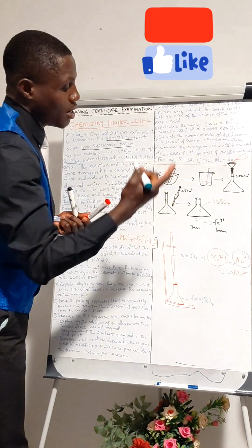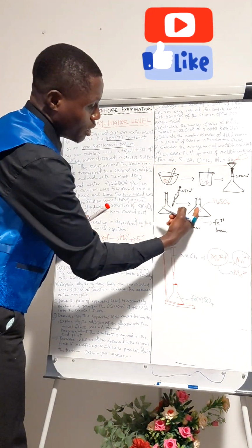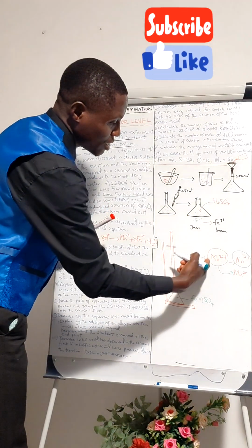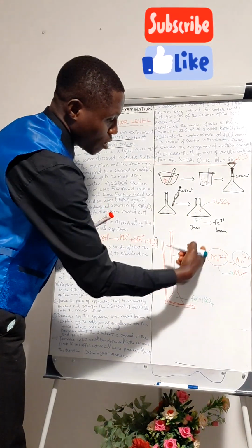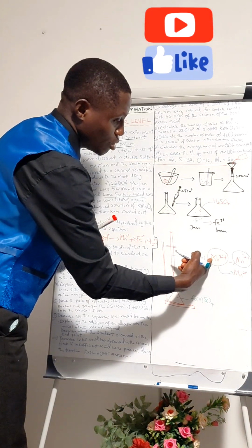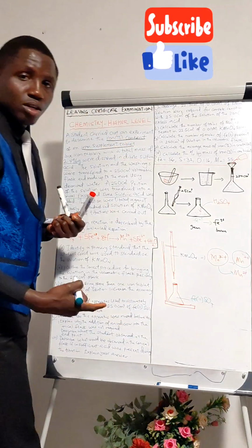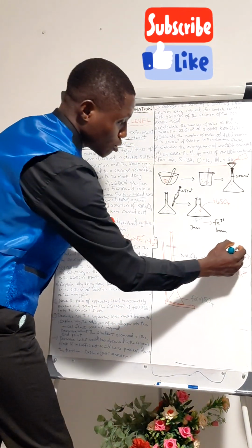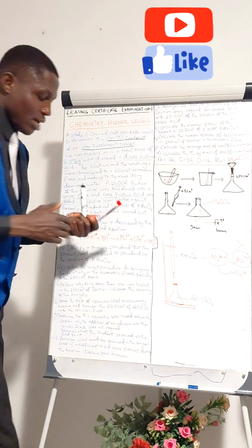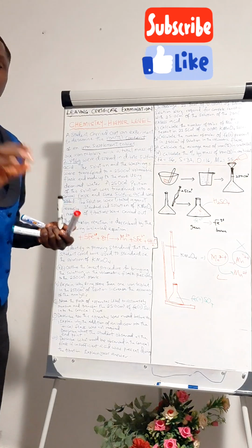For instance, the sulfuric acid helps to keep the iron at +2, and it maintains the reaction of the titration with manganese to reduce from +7 to what? +2, not +4. So the sulfuric acid helps us to eliminate this from happening, but it allows this reaction to occur.